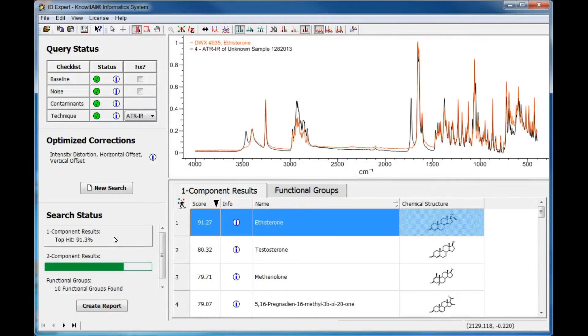As you can see, the one component result is a 91.3% match. Since this was not an exact match, Know-It-All continues and looks for multi-component matches.